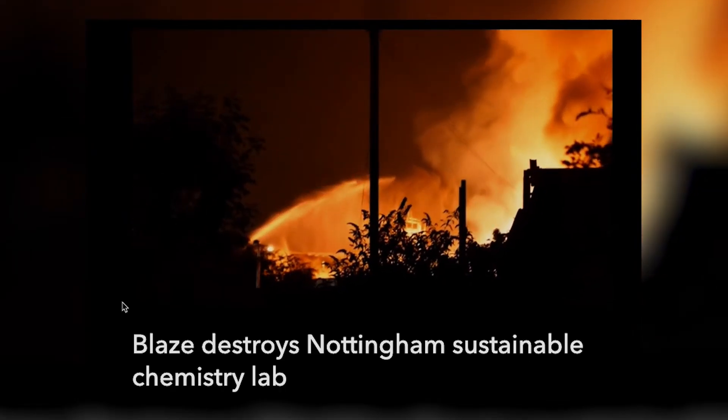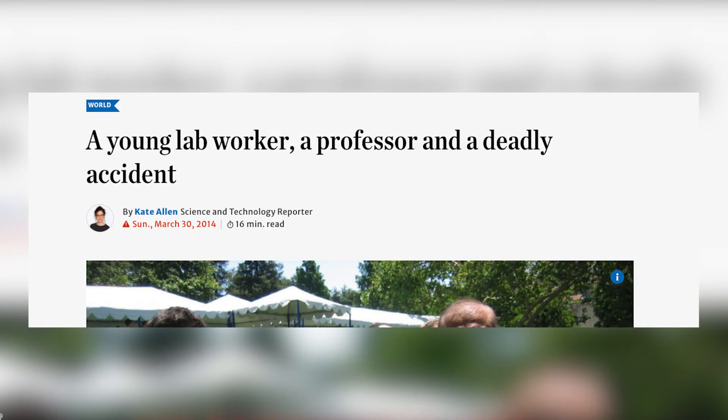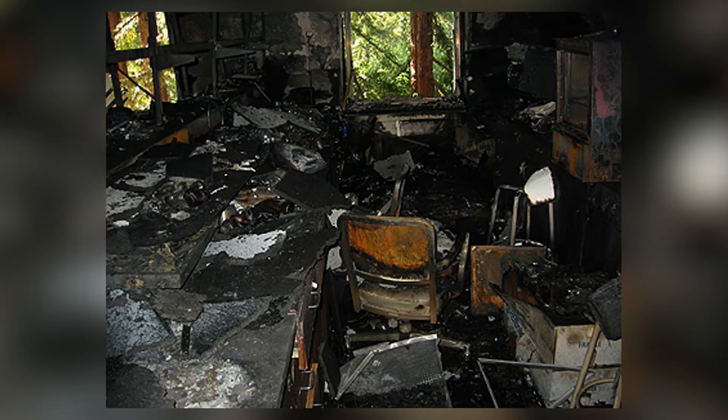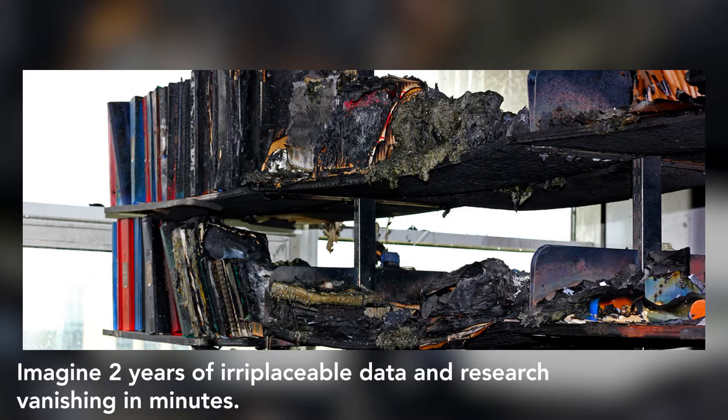Fires are very dangerous and expensive events, so preventing them should be an overriding objective. Small fires can quickly spread and become a major event. In fact, a small fire resulted in the death of a researcher at UCLA, partially because she was not wearing a lab coat — given the material she was working with, she should have been wearing a fire retardant lab coat. Not only do fires harm people, they damage equipment, destroy work, and even a small fire can take a building out of service for months.